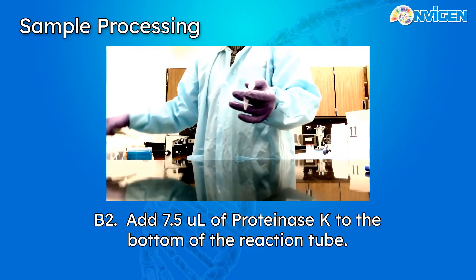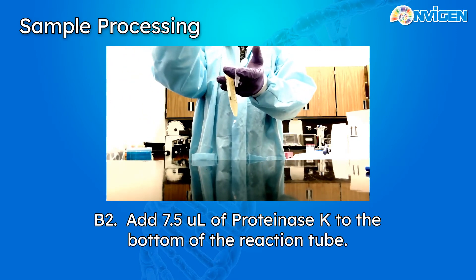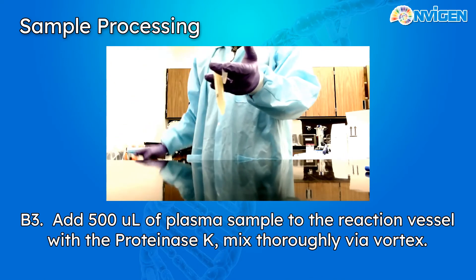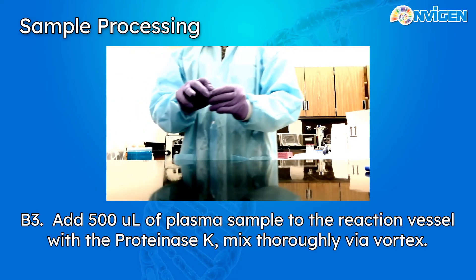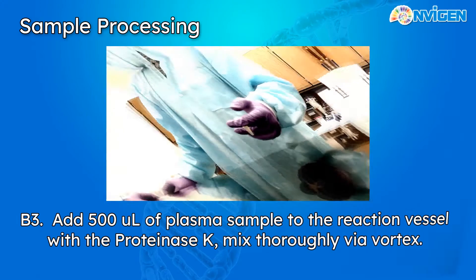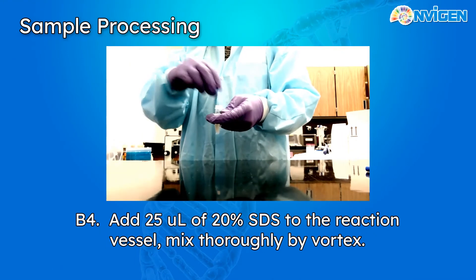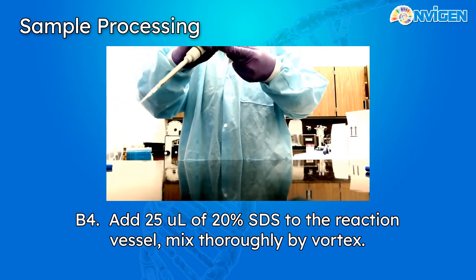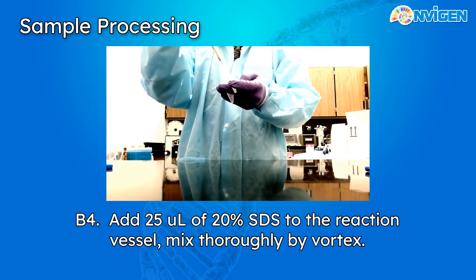Here is our plasma — it's been centrifuged to remove any particulates and it's ready to go. Add 500 microliters of plasma to the tube, seal the tube, and vortex. Now we're going to do the SDS. At 20% concentration, the SDS is likely to have precipitated into a solid at room temperature, so immerse your SDS into a water bath to dissolve the solids and make sure it's well mixed before use. Add 25 microliters, and vortex.